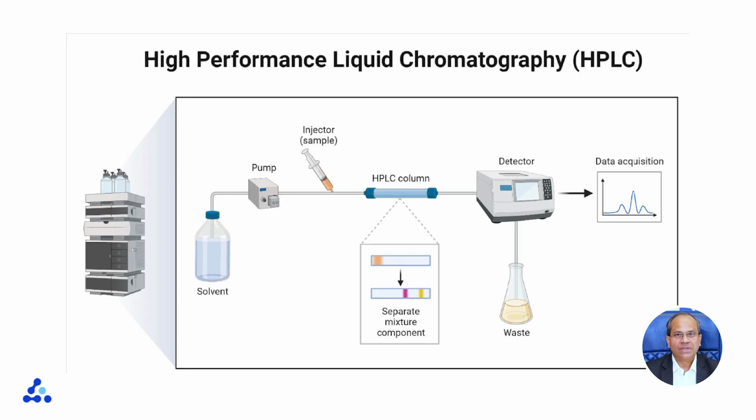is the mobile phase, which moves the analytes along the stationary phase, which is part of the HPLC column, and helps them separate depending on the affinities and interactions with the stationary phase. Obviously, the quality of the mobile phase, be it a solvent or solvent mixture, and its choice will determine the success of chromatographic applications, whatever be the variations, be it prep HPLC, HPLC, UHPLC, ULCMS, LCMS or LCMS-MS.